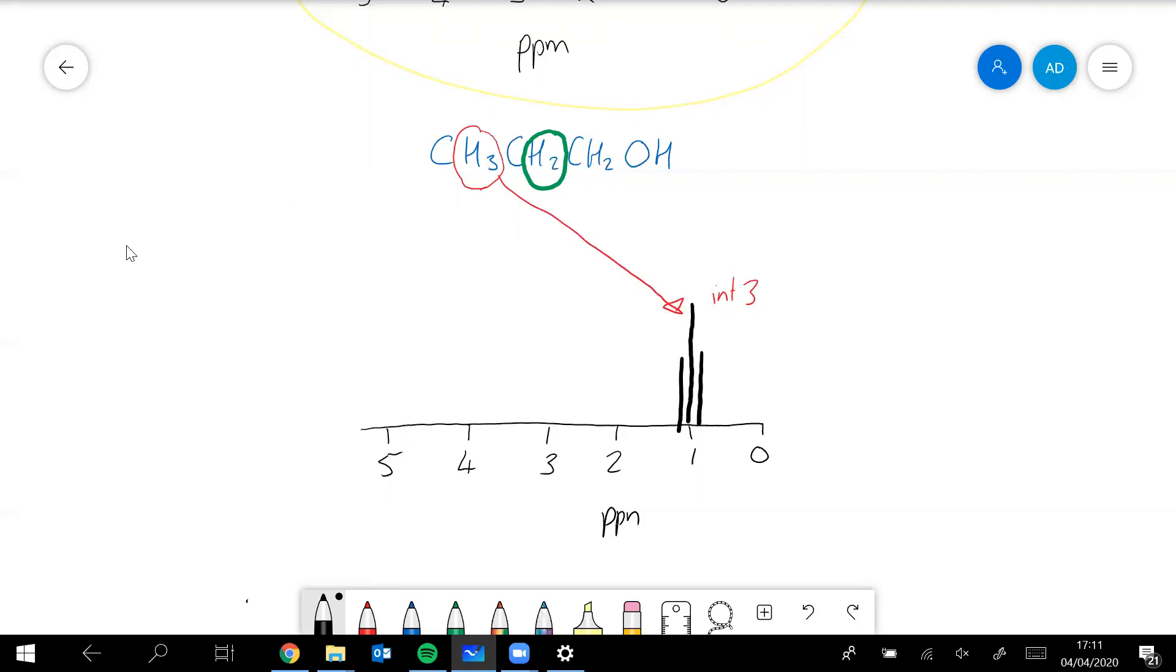So the sextet will look something like this. It's going to be fairly close to the other one. So that will give us that peak there.